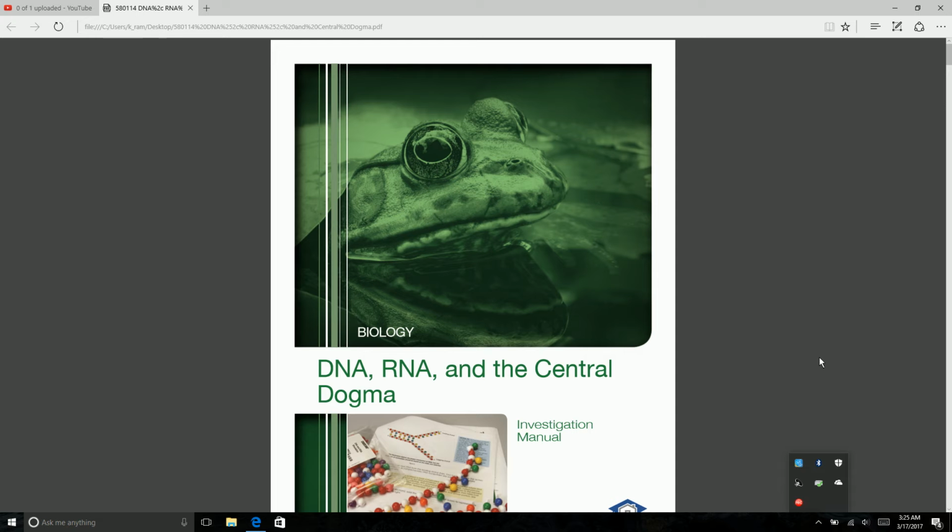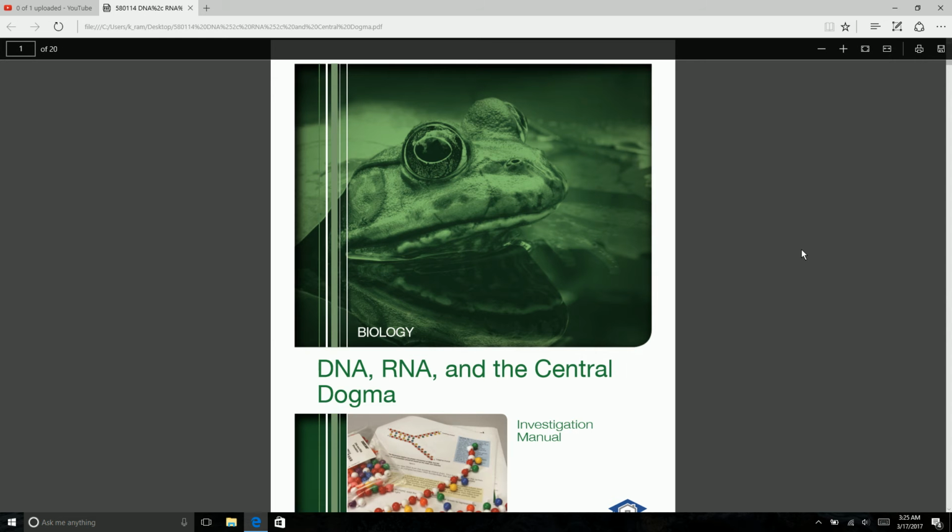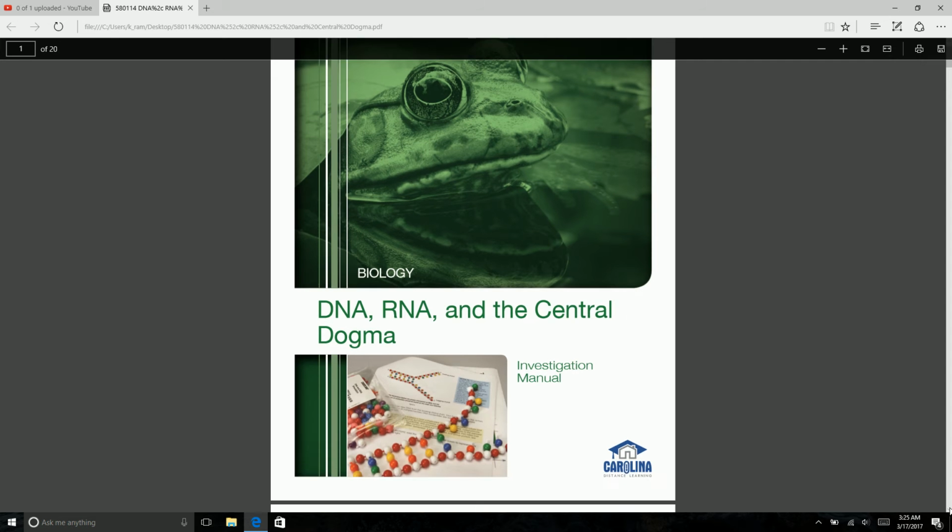Okay, so I'm going to talk in this video about the lab you guys are going to do this week. The lab this week is from the Carolina kit. I hope all of you have purchased this kit because this kit has two experiments. The first experiment we will be doing this week, and the second experiment we are going to do around the 7th week. So basically the first week is DNA, RNA and central dogma.